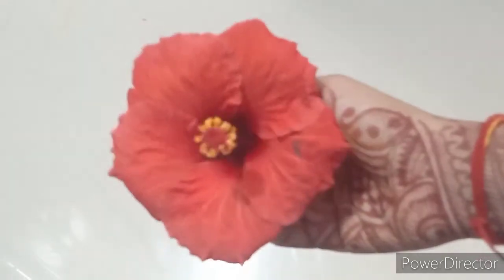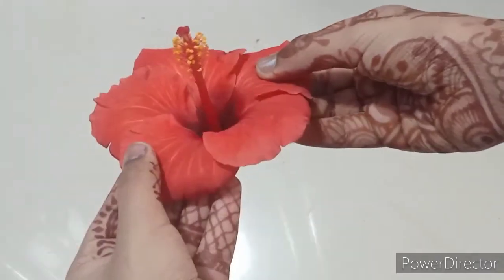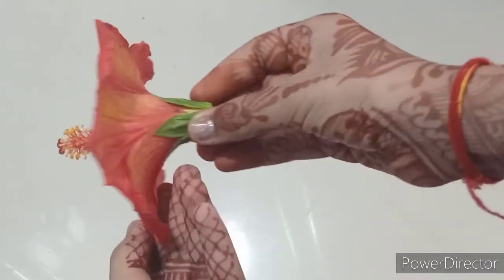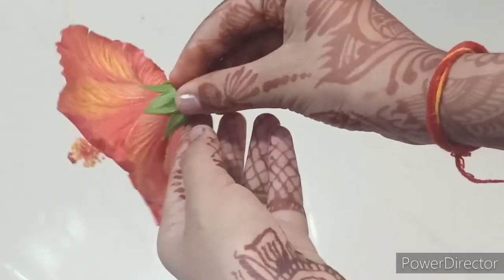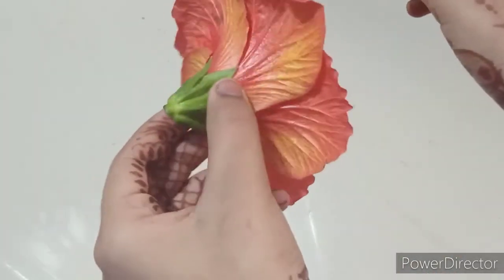Hello, my name is Aishania and today I'm going to be dissecting a flower. I am using a hibiscus as it is a bisexual flower and contains both the male and female gametes. Let's get started.